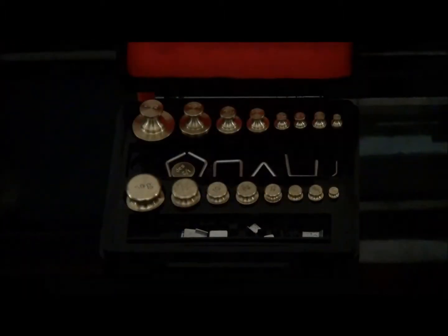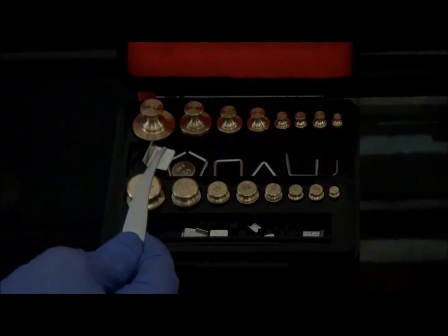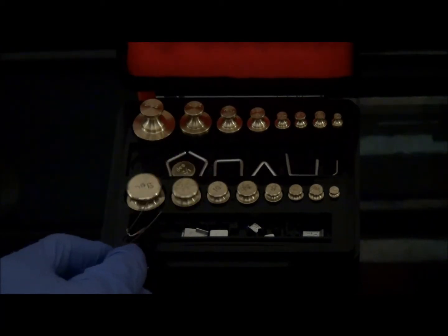Weights that weigh more than one gram are made of either finely lacquered brass, rhodium plated bronze, or in our case, non-magnetic stainless steel. The smaller square shaped milligram weights are made of platinum or aluminum foil with one edge folded up, allowing for easier handling with forceps.